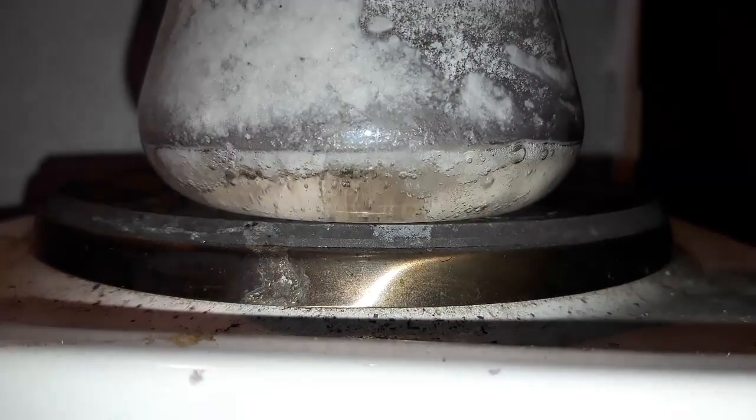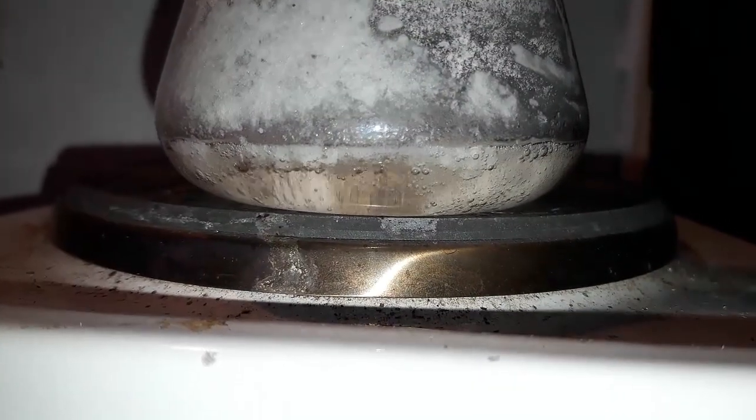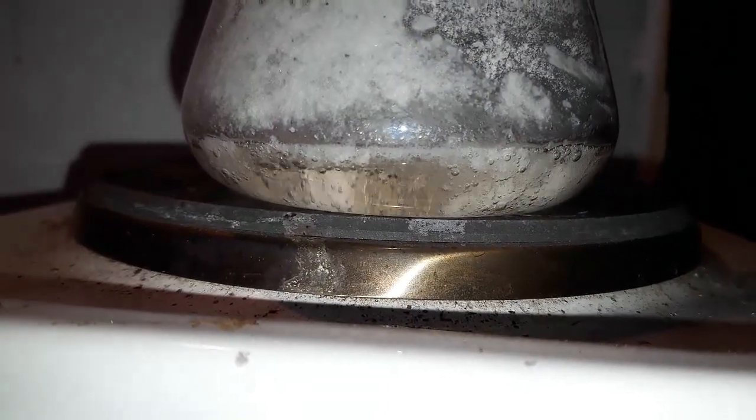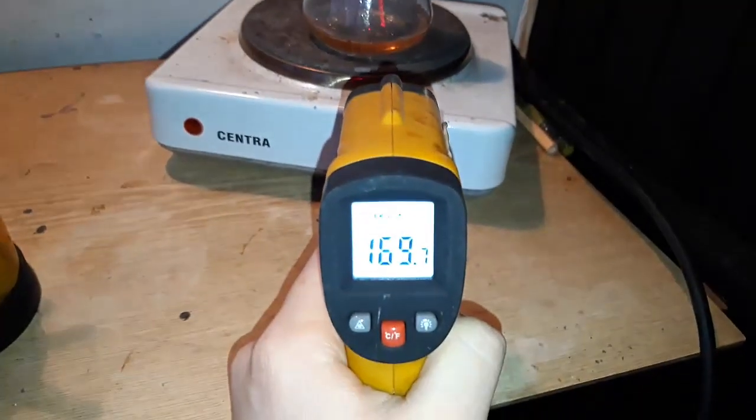After about five minutes of heating, all the solids clump up and melt. Keep the temperature at about 180 degrees Celsius.